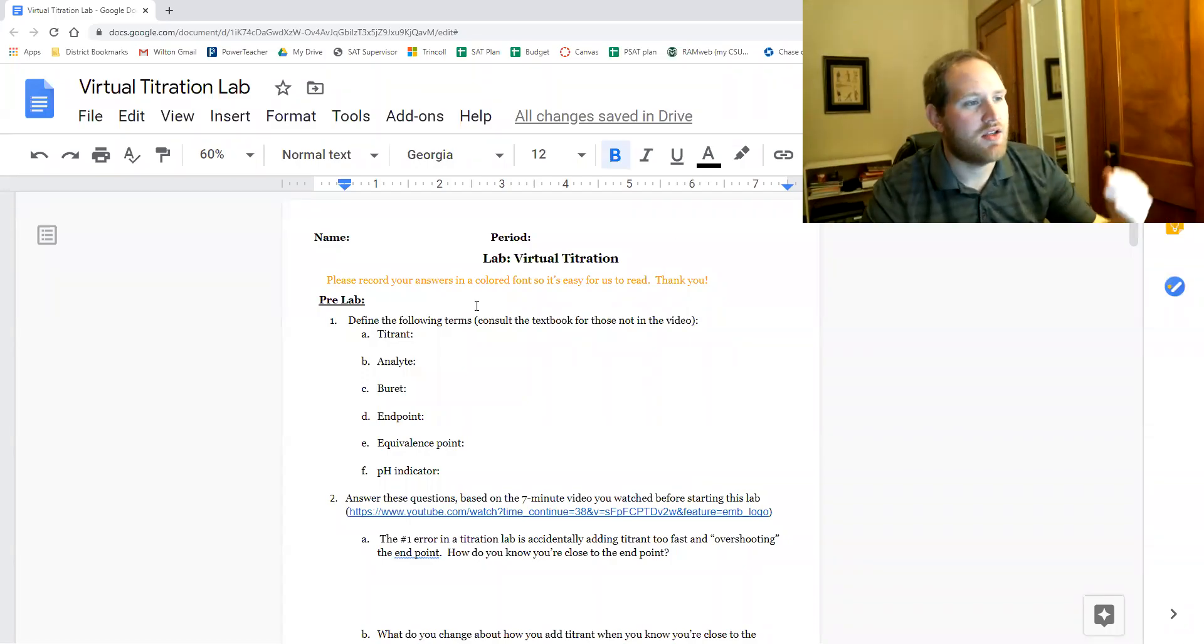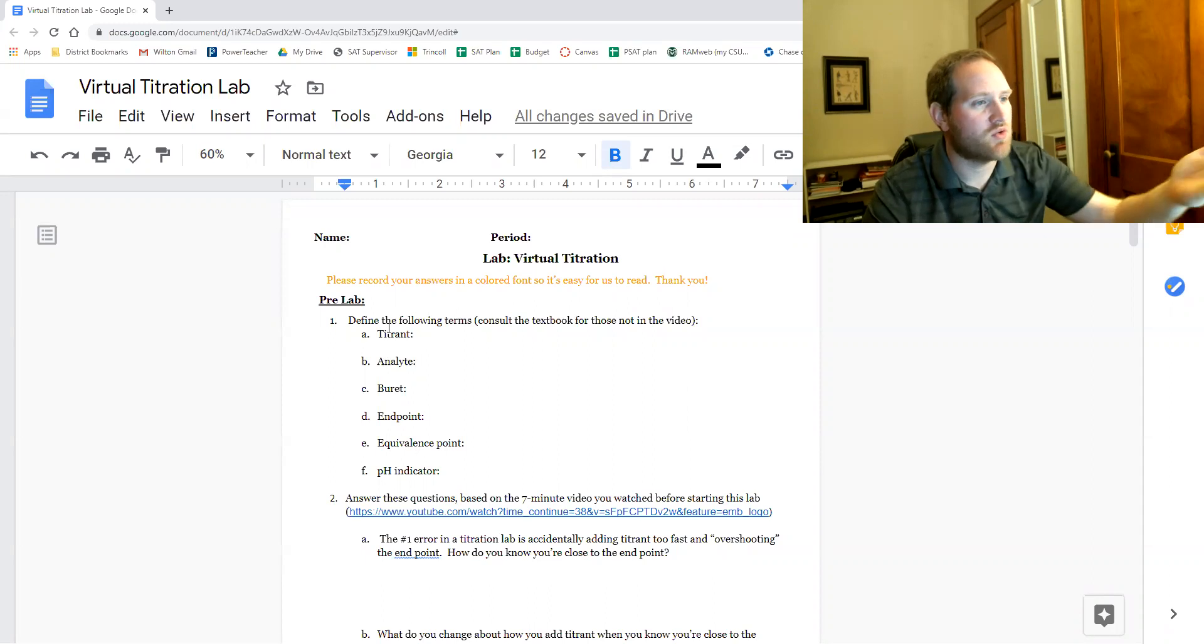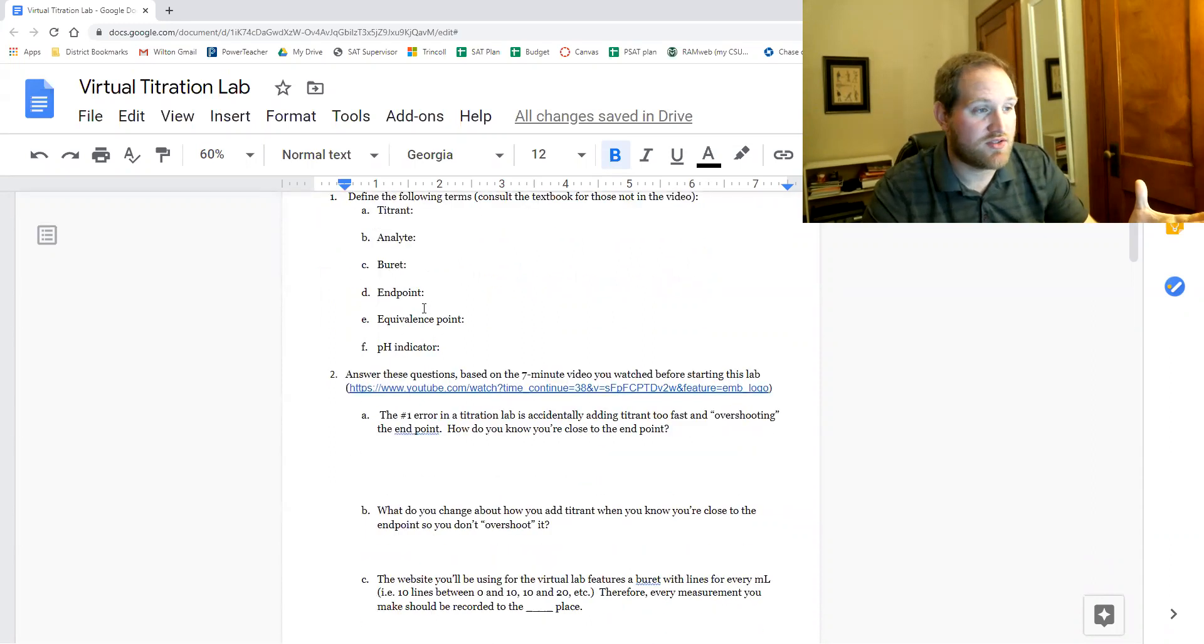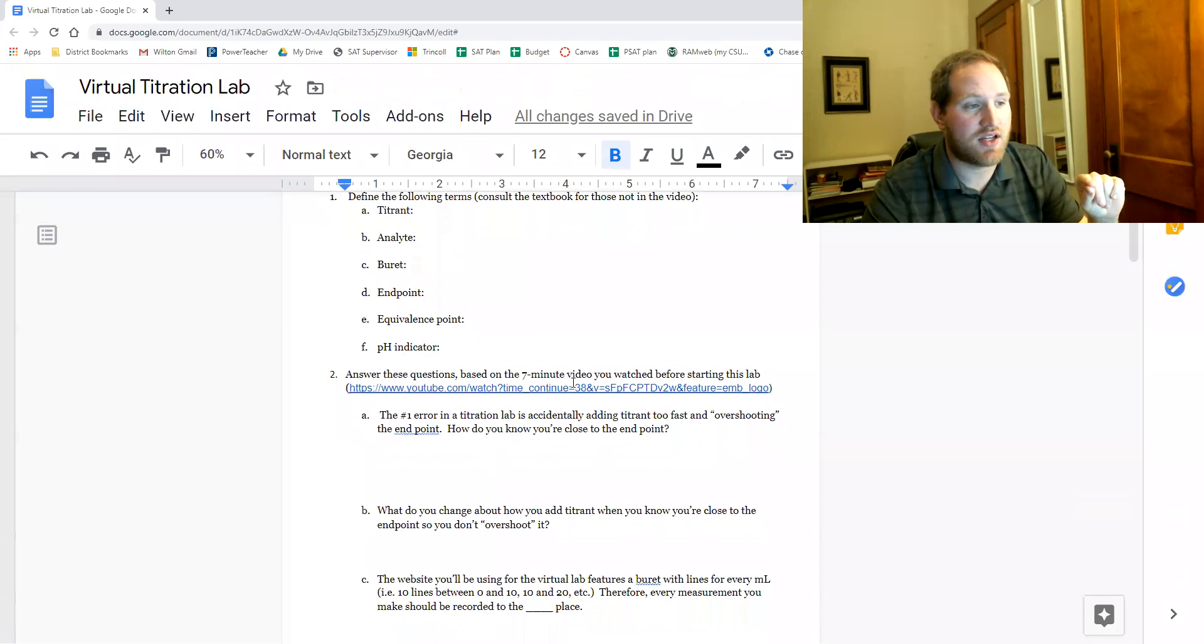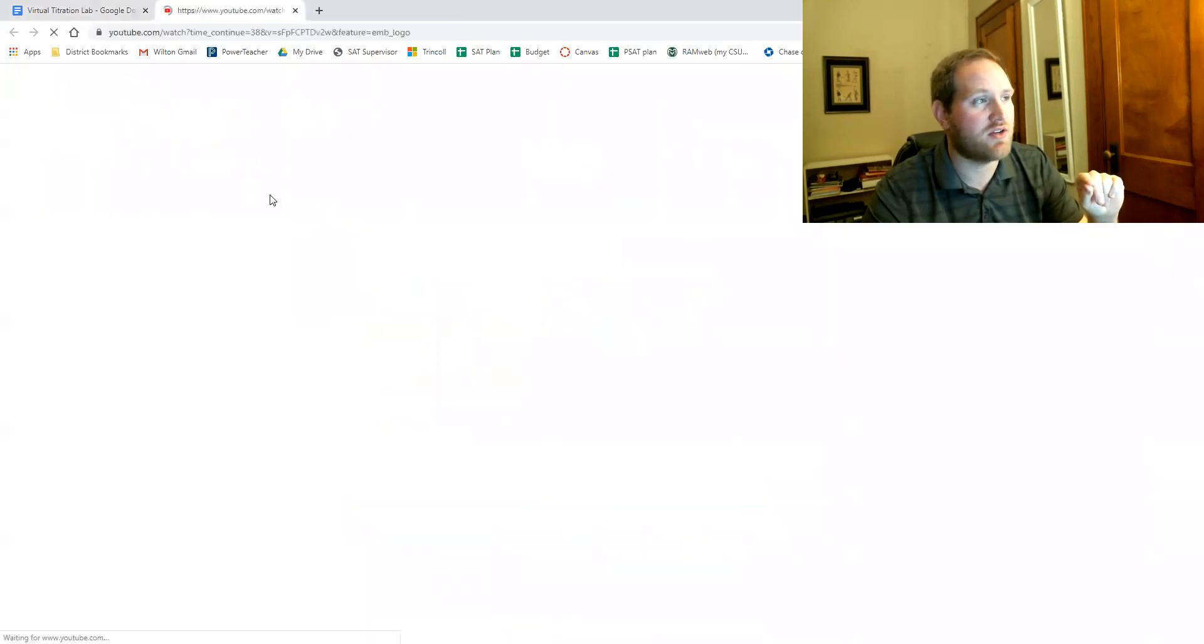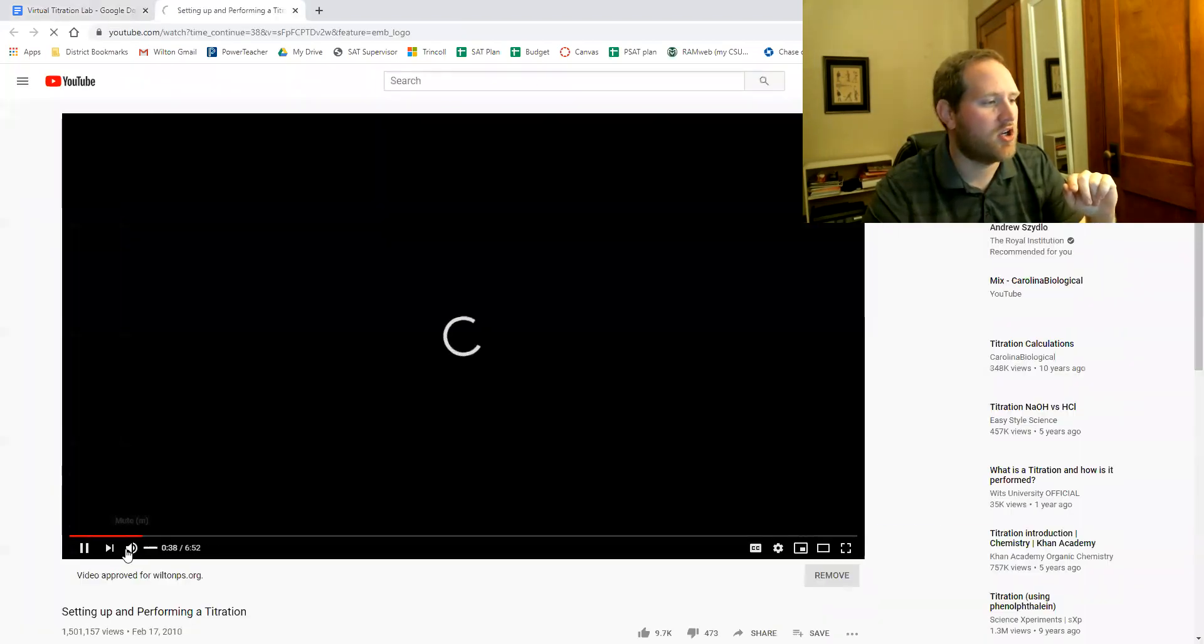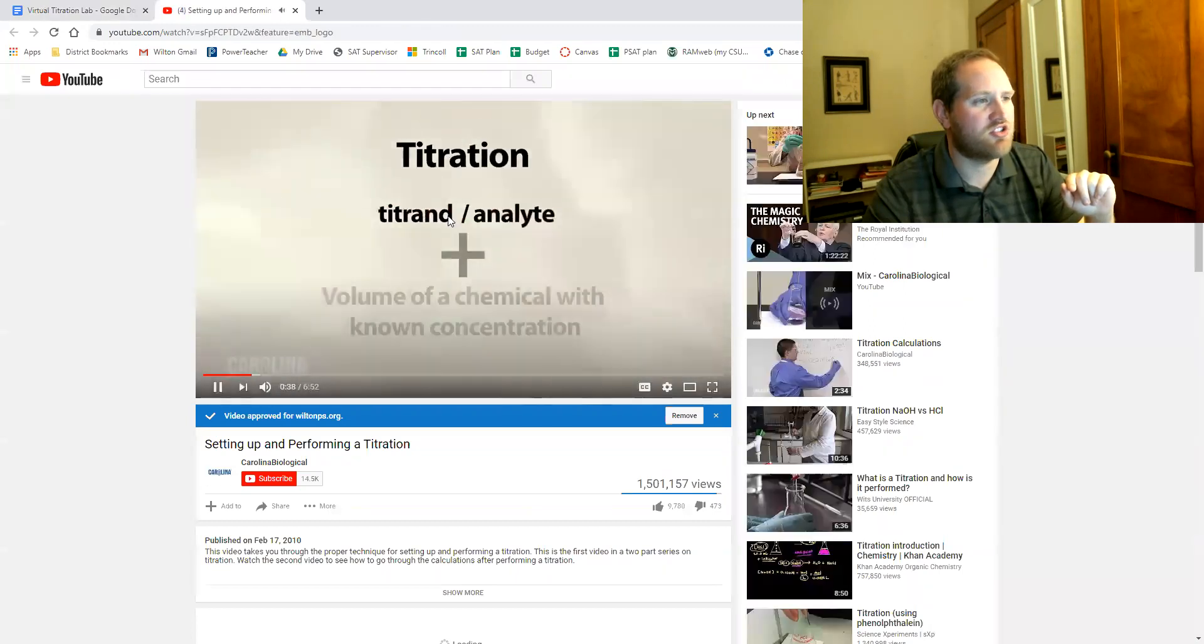Hi everyone. In this video I'm going to run through the virtual titration lab. So here's the document. You're gonna start with the pre-lab questions. These are mostly based on this seven-minute video here. This was the Carolina video going through the titration lab.